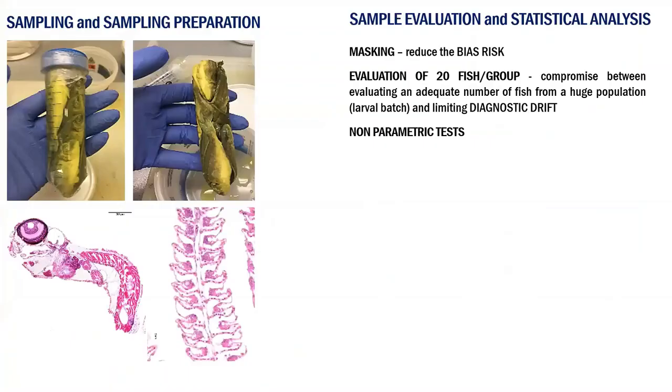I remind you, as I mentioned above, that tissue quality is essential for a successful evaluation. Although a skilled histopathologist can, to some extent, recognize and compensate for wrongdoings in histologic preparations, specimens that are not fresh or poorly fixed undergo postmortem lysis that partially or totally compromises analysis or leads to artifacts that make histologic evaluation difficult or impossible.